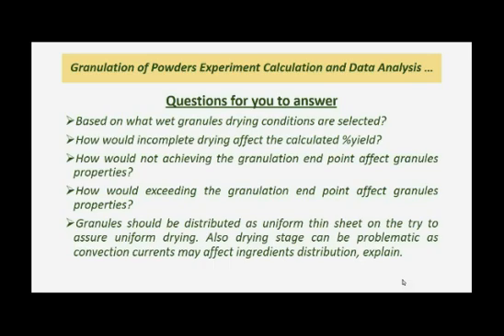This means if we didn't continue addition up to the endpoint. This will affect the granules properties, ending with friable granules or weak granules, as well as affect the calculated percentage yield in different ways.